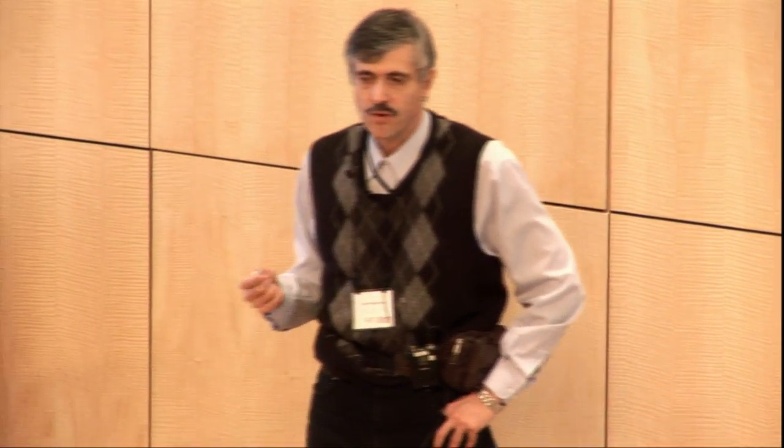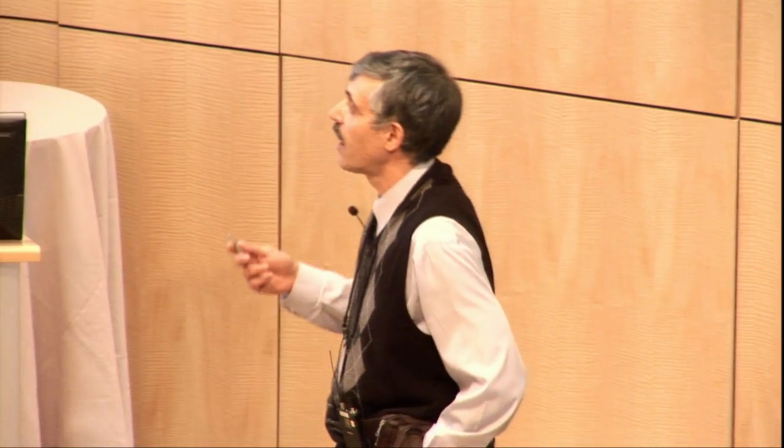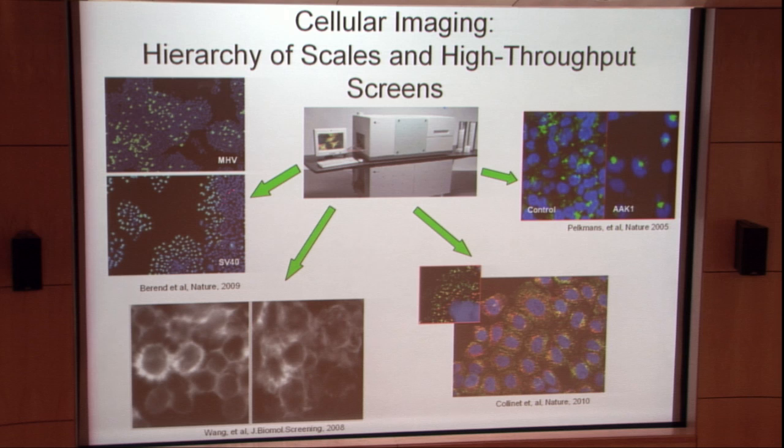Then it depends on which scale of magnification you are working at. You go to different algorithms and different approaches to extract information, and you have to extract different kinds of information. There is no general approach. For example, in this example, what you see on the left are like dots, which are individual cells.